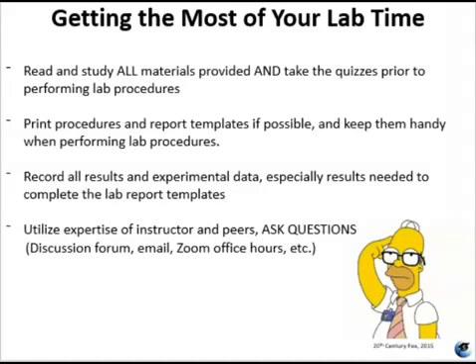Having said that, not all of your lab procedures are going to be performed in a wet lab environment. Some of them, in fact, fully half of the procedures, are actually going to be simulations that you do virtually online. But you should take note of all of the procedural steps for those simulations as well. Record all of your results, all of your experimental data, especially results that are needed to complete the lab report templates. You do have templates for the lab reports, so if you look ahead to the results sections on those templates, you'll see exactly what you will need to report on ahead of time, which is helpful.